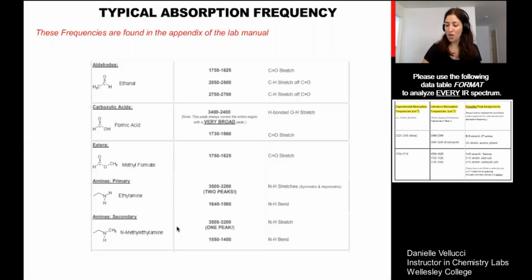Okay. When you go towards carboxylic acids and amines, you have hydrogen bonding hydrogens in your molecule again. The spectrum starts to look a little different than it does for an ordinary alcohol.